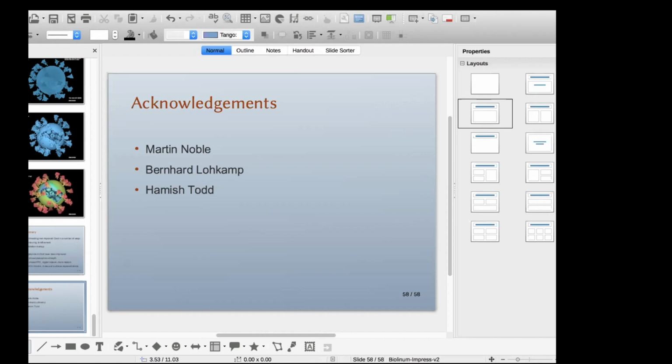I did try to keep in mind that I would be doing this. I think this sort of representation with the shutter stereo, you know what I mean, the NVIDIA stereo, would work nicely, although it may be that because the perception of depth is improved, you need it less. Yeah. We don't know how long it's going to be functional or around. Presumably it'll be around as long as Windows 7 is around, and then that goes till what, 2024 or something. So after that, who knows?